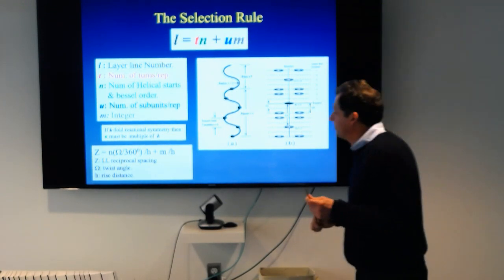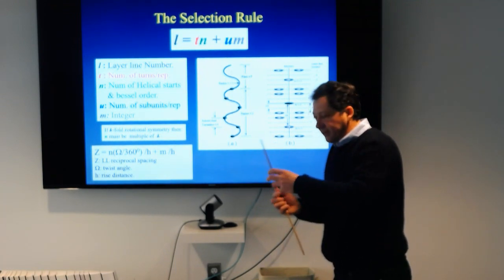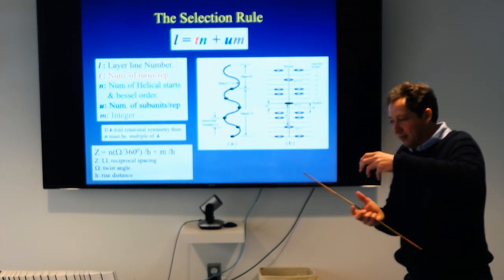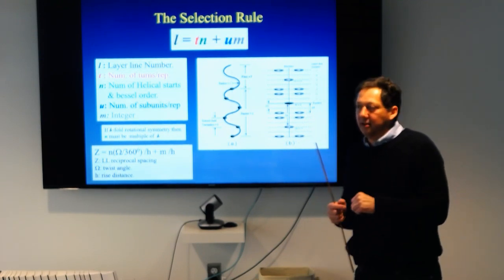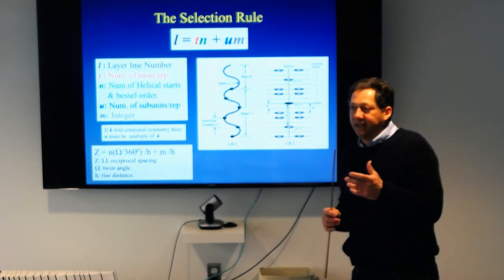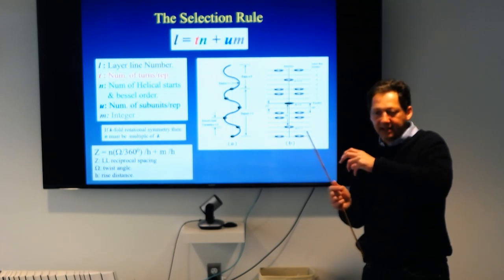So, there are no perfect helices, okay? You're not going to find exactly, let's say, 13 units in 6 turns, but maybe it's more like 14 in 12 turns. So it's almost the same, but not exactly.